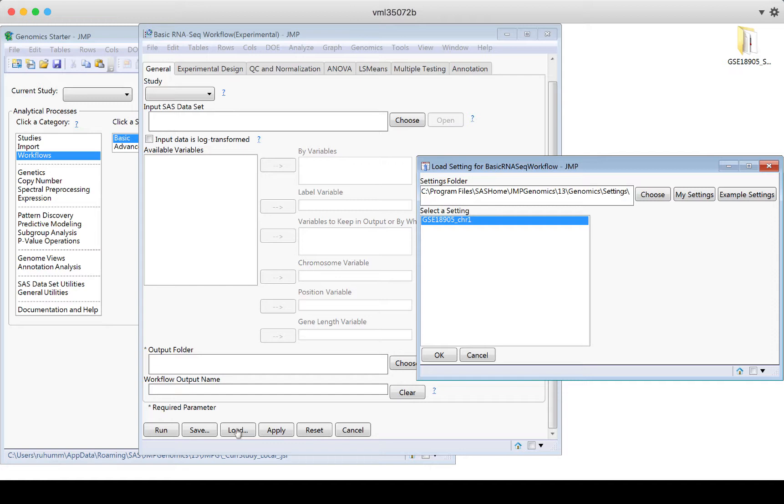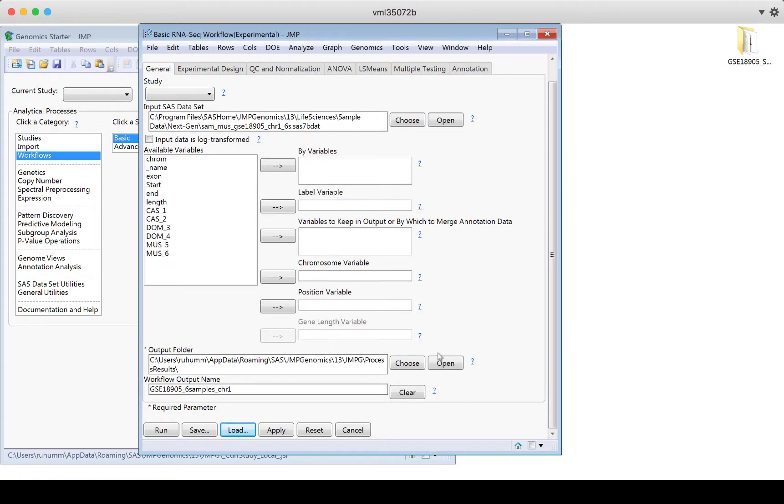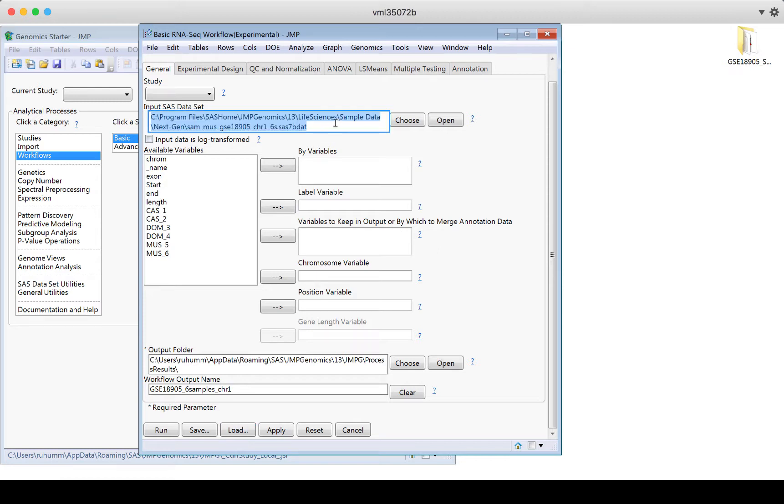So this is the best way to start using JMP Genomics, is to open it up, click on workflows, find the workflow that matches what you think you're interested in, and then go to the bottom of that dialog window, click load. And then if there is a sample available, it's going to suggest any samples that are available. In this case, we only have one. So I'm going to say, okay, there's not a choice I need to make here.